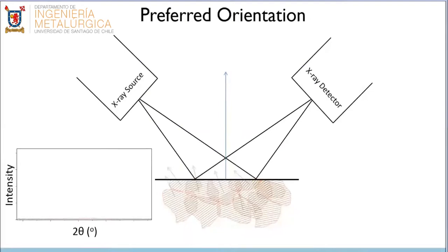produce a diffraction peak. When we collect pole figures, we align the source and detector at angles such that diffraction from a certain plane should occur. We then rotate the sample around two axes to determine qualitatively how many grains are aligned with the diffraction vector at each position. Let's go ahead and look at a real-life example.